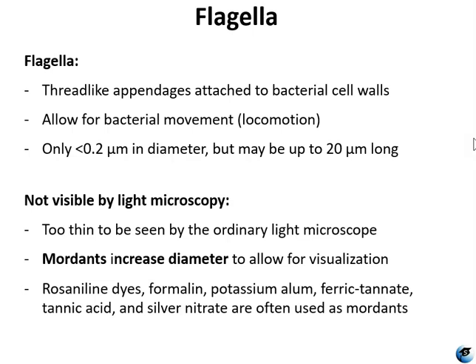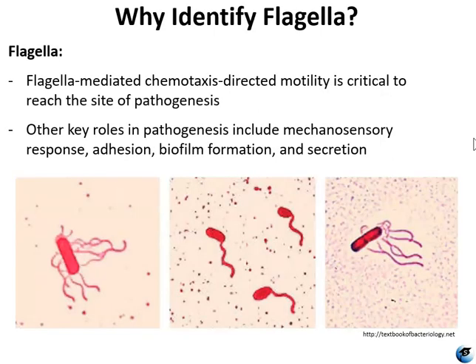In fact, I don't even have my students in my on-site labs perform the flagella stains because of the heavy metals and tannic acid that's involved. So we actually only view pre-made slides in class. Flagella staining and characterization are routinely used in identification of suspected pathogens.